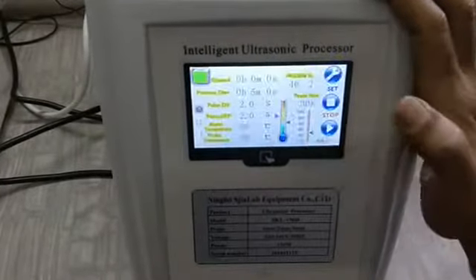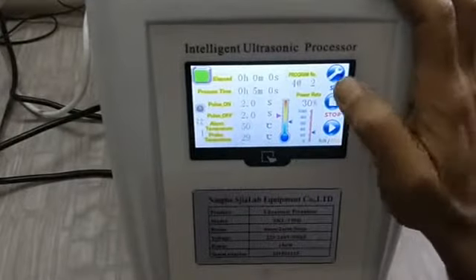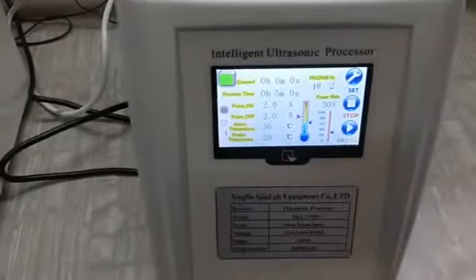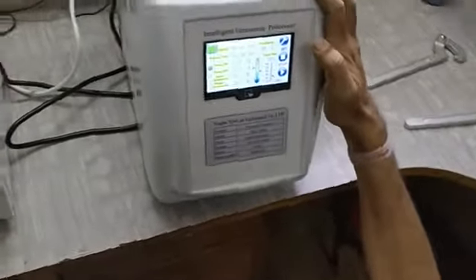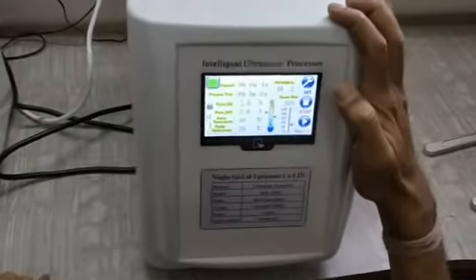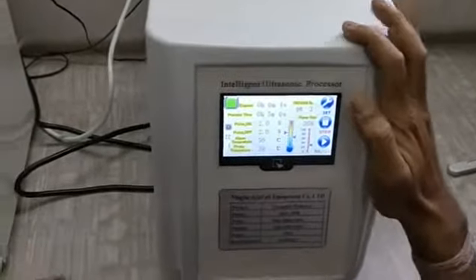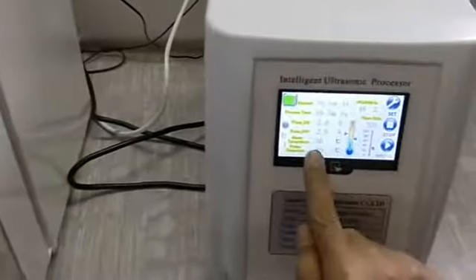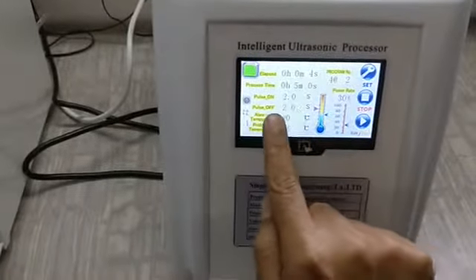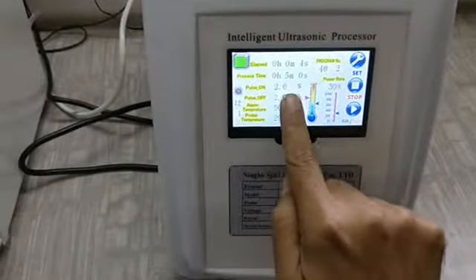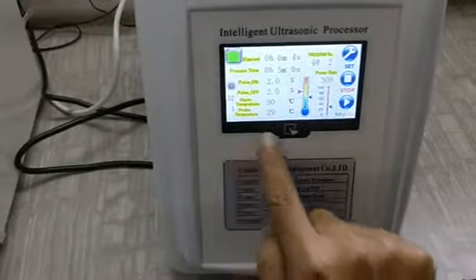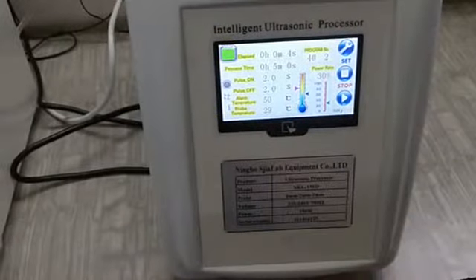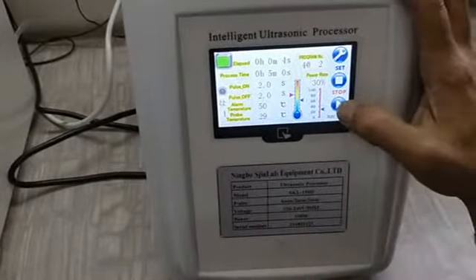Now I will go and say run. My program number 4 is set. Now we have made our program and we just have to run it. Let us see how it goes. Once again, let us see. Processing time is 5 minutes. On pulse is 2 seconds. Off pulse is 2 seconds. Alarm temperature is 50 degrees centigrade. This is the current temperature, 29 degrees centigrade. I will just say run.